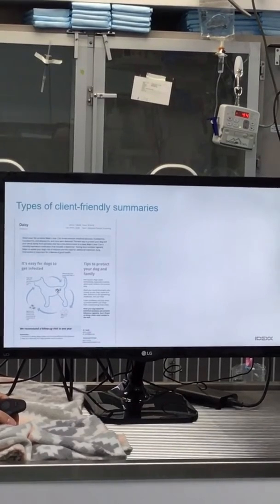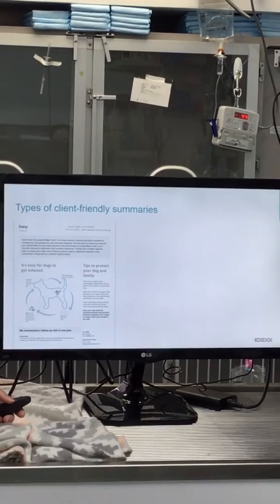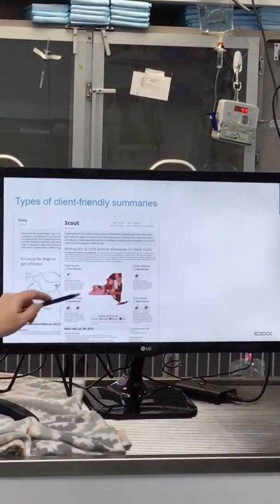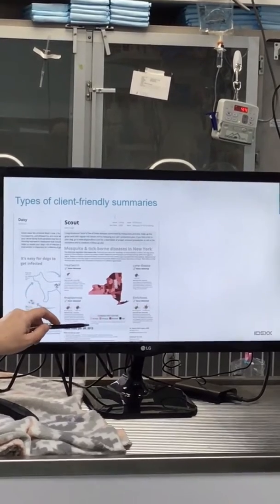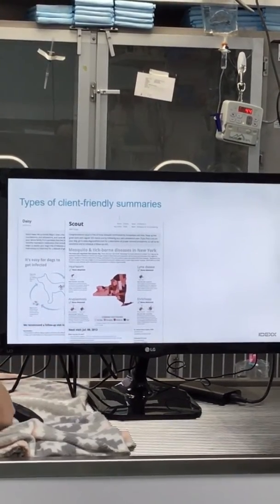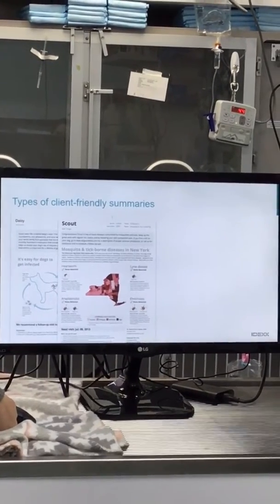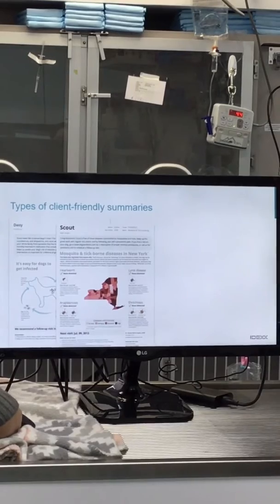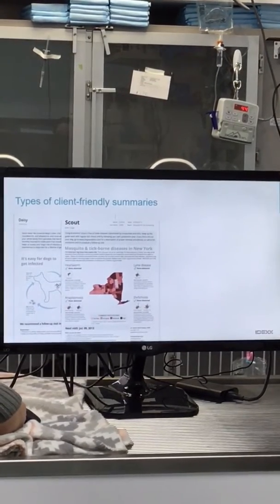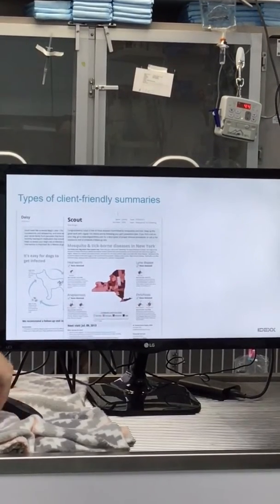So that's your fecal. But we know that it's zoonotic sometimes. People just forget about that. For Idexx, same thing. It would have the state of Tennessee, and it's got the prevalence map. Because we know that if their pet is positive, ticks don't care whose hairy leg it is. So if your dog has Lyme's, there's a good chance that you have Lyme in your area. So you need to be really careful for yourself and your family to know that if you have a tick, take it off before something can happen.